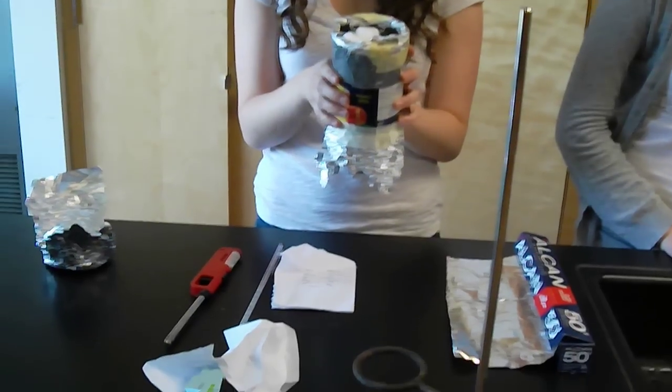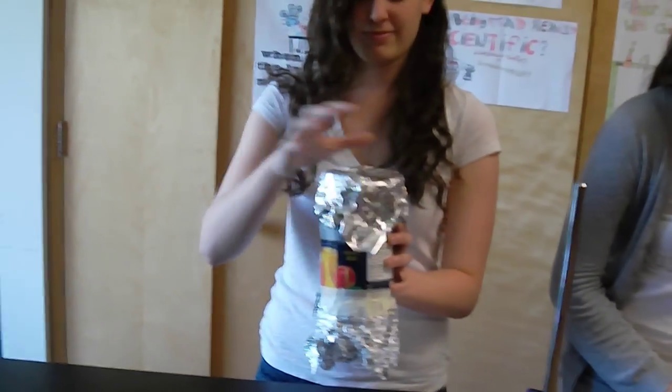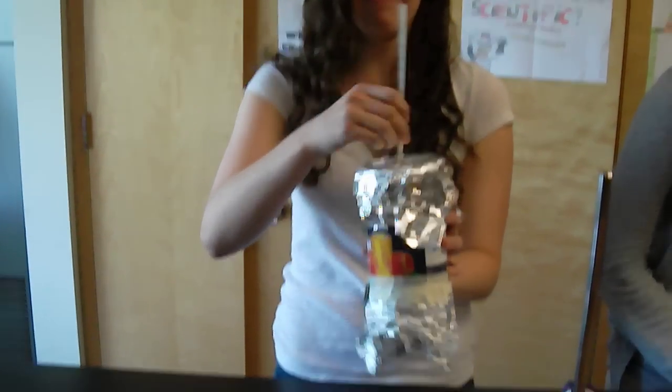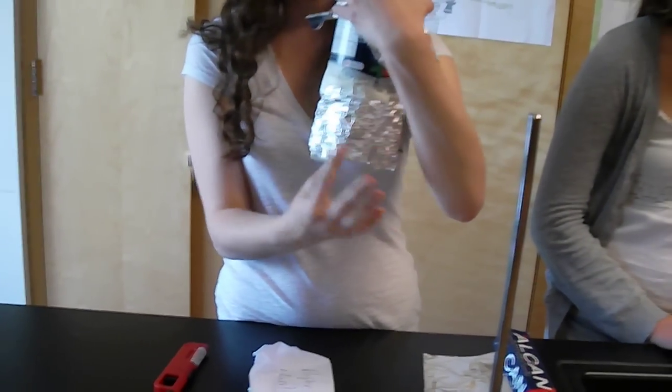We colored the bottom of the larger can black so we could absorb the heat from the candle underneath. We used a lid of tin foil over the larger can, leaving room for the thermometer to stick out. This lid stops conduction. On the bottom of the can, we made a tin foil skirt in order to trap heat given off by the candle, leading it up to the can.